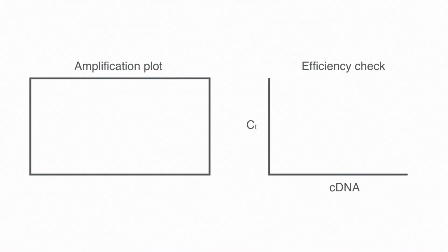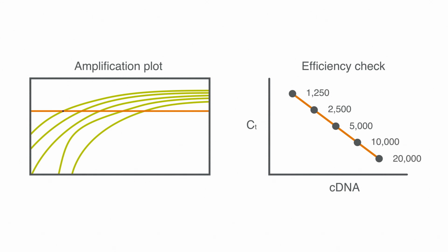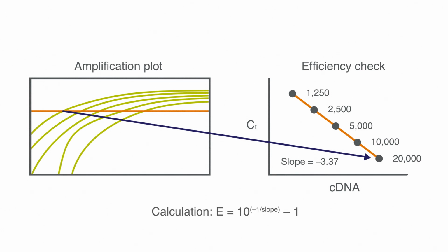In a previous Taq Talk video, we discussed assay efficiency and how to calculate it. Now let's talk about how high or low assay efficiency impacts real-time PCR data. The aim of all real-time PCR assays is to be 100% efficient, which means there's an exact doubling of template in every cycle. We previously found that this can be calculated using a dilution series and the following equation.